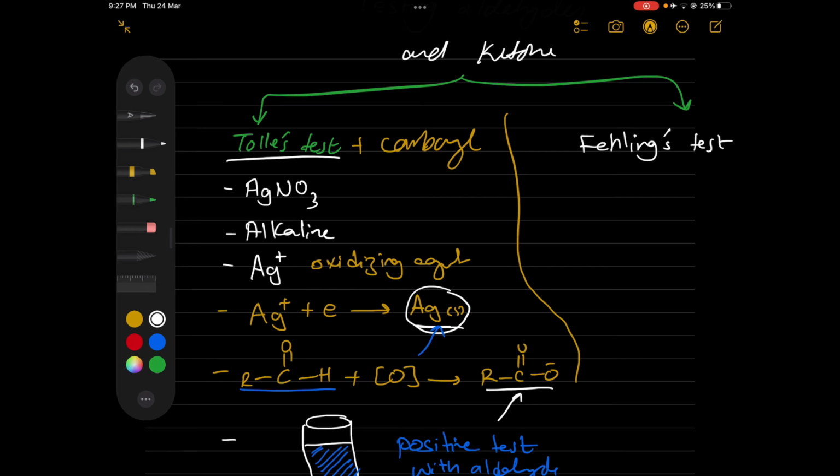The Fehling test is actually based on a redox reaction, and it has the same principle as the silver ions. The hero that we're going to use today is Cu2+. The Cu2+ ions, as we remember, are blue. So we take these blue copper ions, and the Fehling test, as we can see, uses Cu2+. We will mix it with the carbonyl compound and then warm it.